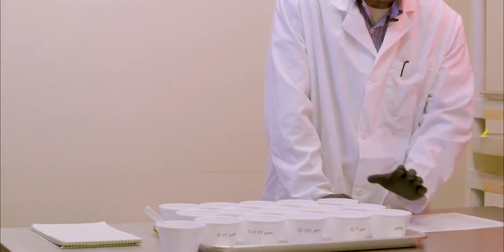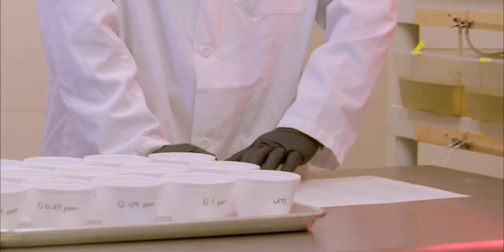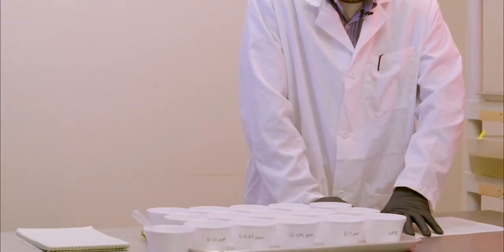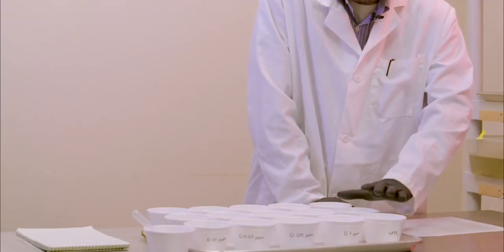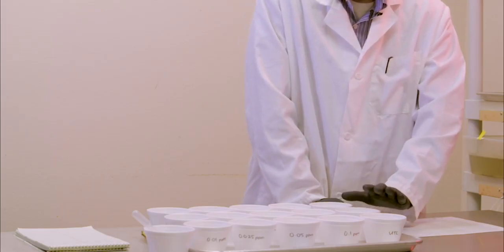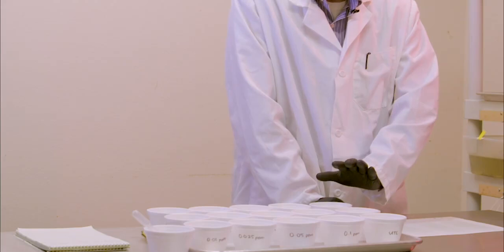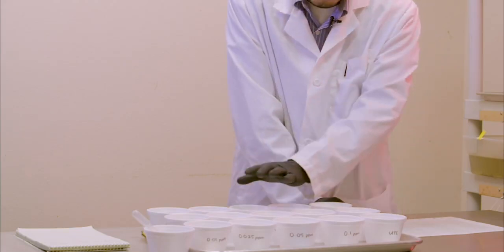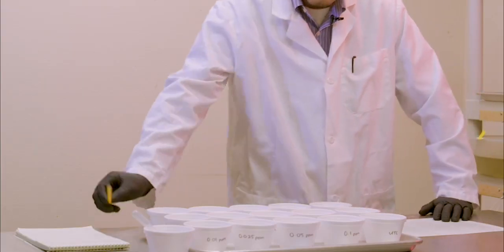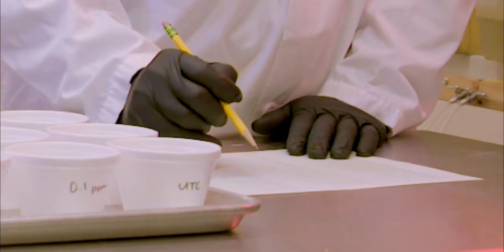If you see the distribution of data points scattered on the paper, not approximating a straight line, there's greater variability in the bioassay data. You may have to decide to repeat your bioassay or just discard the data. If the mortality data are scattered, is there any value in this? Of course, they still have value. You can estimate the line through this data. You can guess next time where your range should be.